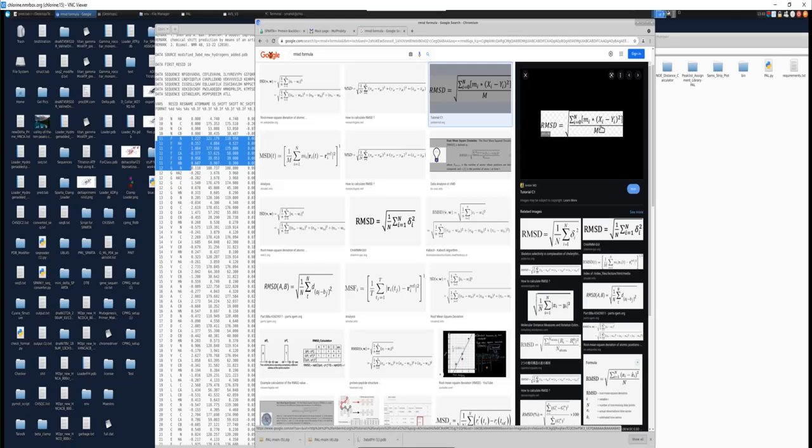They don't show it here, but you would divide that by the error that's in the SPARTA+ file. You square that. And then you can add multiple atoms. So you do the exact same thing for your carbonyl, for your C alpha, for your C beta, and you add up all of those values. Then you divide it by the number of atoms you have, and that will give you, once you take the square root, the RMSD.